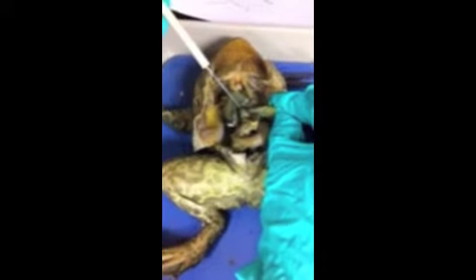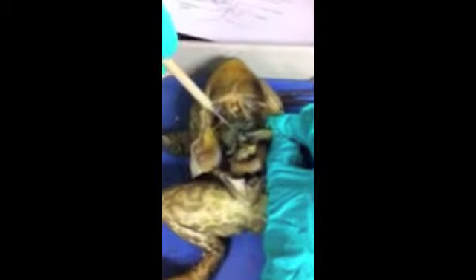Right under these 3 lobes from the liver is the gallbladder. The gallbladder is below the liver. This organ aids mainly in fat digestion and concentrates bile produced by the liver.